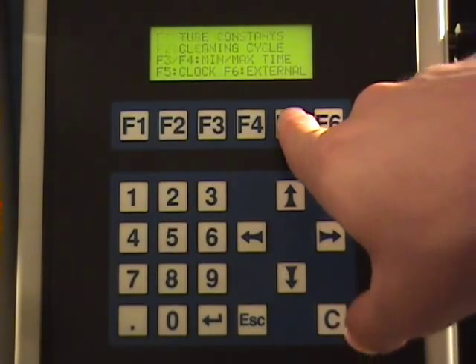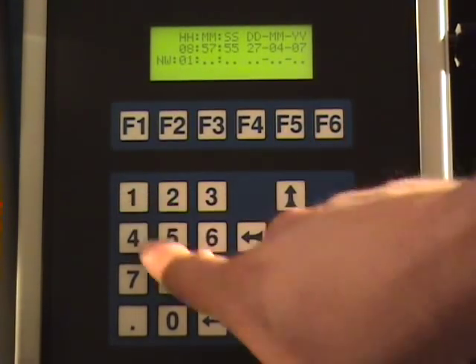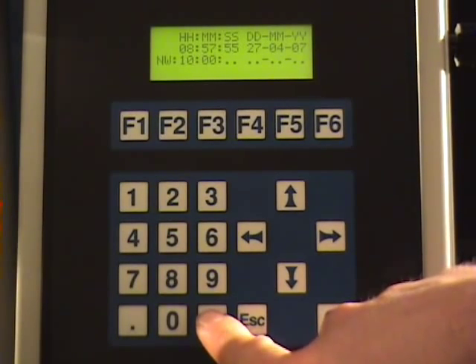Choosing F5 from the parameter menu brings you to the system's clock menu where you can enter the time and date which will be included on each measurement printout.